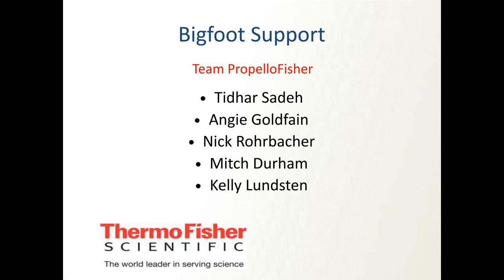Thank you, Alan. Looks like we have time for one more question. Any advice on transferring panels from your spectral analyzer to the Bigfoot?